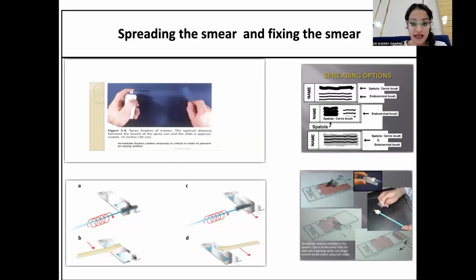Because of that, it could lead to a poor quality smear, which could lead to loss of the sample, and we will not be able to diagnose some precancerous conditions, or in case the cells are very few, then we will not be able to diagnose it.